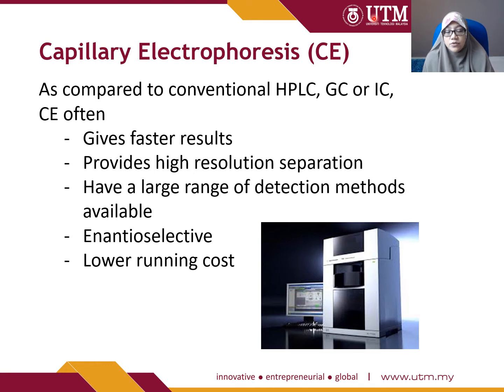DNA analysis also uses this CE mode of instrument. Okay, DNA analyzer is also salah satu jenis capillary electrophoresis.